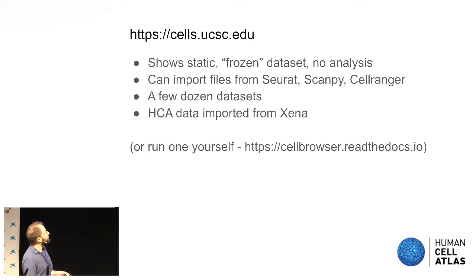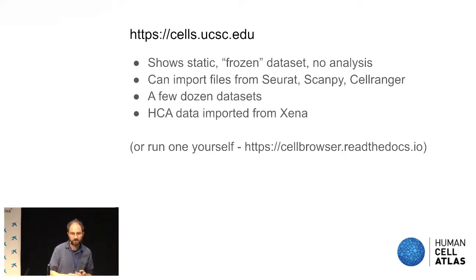The aim of our little cell browser is that it's a website that shows you a static freeze of the data. It's mostly based on a t-SNE view. Because it's a frozen view of your data, we import Seurat, Scanpy, Cell Ranger, or any other format you have, so it's the result of the author's paper.